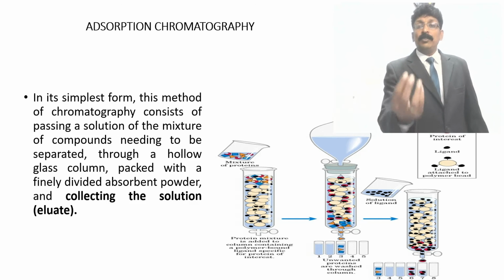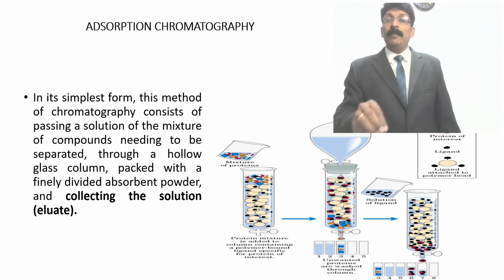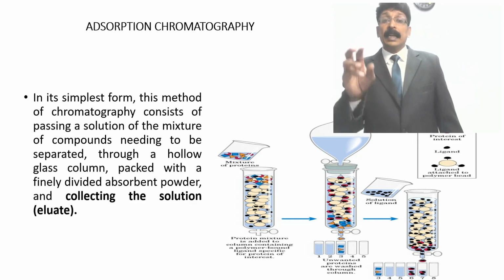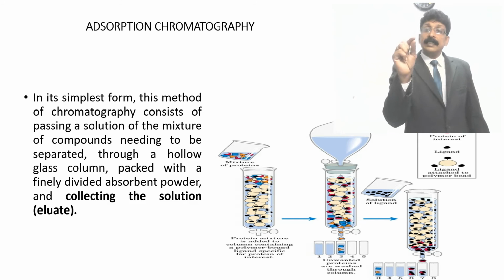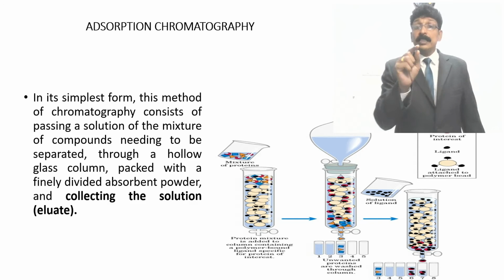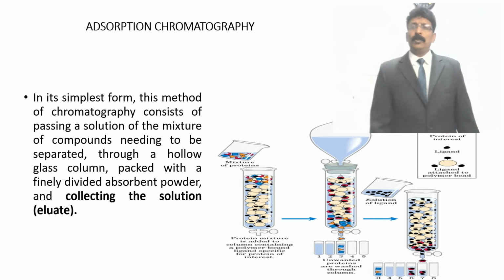According to the size of the molecule, it goes inside, and we are interested to separate one compound, the main thing is the red color. You can see there is a reddish moon shape, a square shape, and an orange triangle shape. So just imagine we are interested to separate the red. This is an example just to help the student understand.